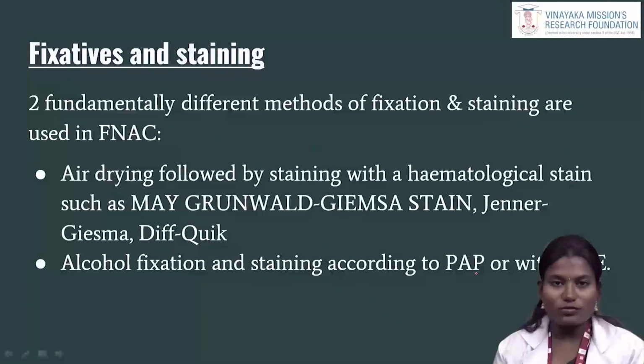Fixatives and staining. What are the fixatives? We use 70 to 80% ethanol, formalin, glutaraldehyde and formaldehyde, used for fixation to prevent contamination and putrefaction by bacteria. Then what stains do we routinely use for FNAC? H&E, May-Grunwald Giemsa stains, and Papanicolaou stains.